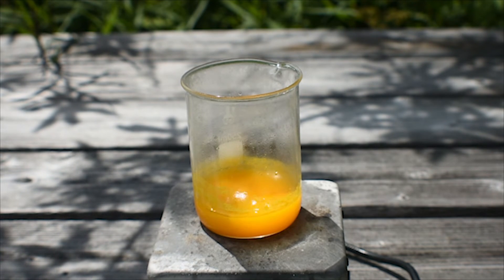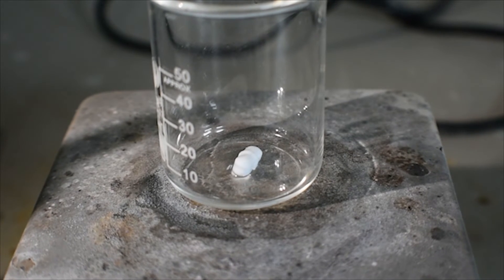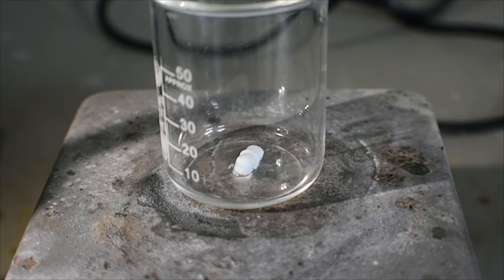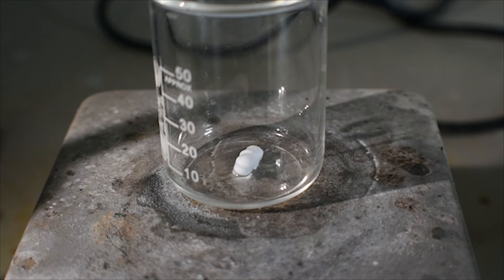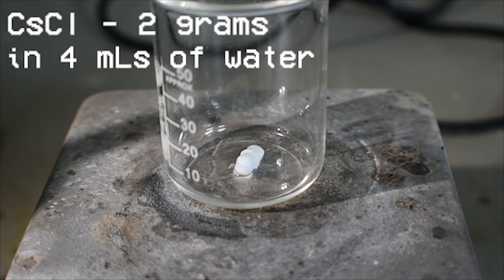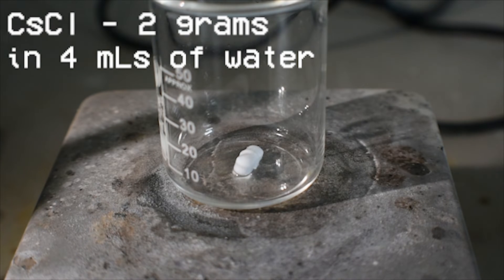So I'll come back when I'm ready to do that. So here in the beaker I have two grams of cesium chloride dissolved in the minimal amount of water, which is about four milliliters or so. It's actually really soluble, come to find out.